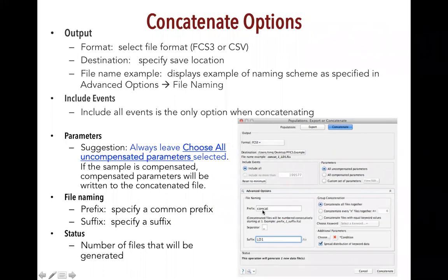Always include all events. Leave the parameters as all uncompensated parameters because you do not want to export the corrected compensated data — you want the raw data plus a compensation matrix. Under advanced options for naming, you can give a prefix or suffix unique to your concatenated file. There are options to concatenate all files together, concatenate every specified N number of files, or concatenate files with equal keyword values — useful if you have 20 files across five patients and want to merge by patient ID.